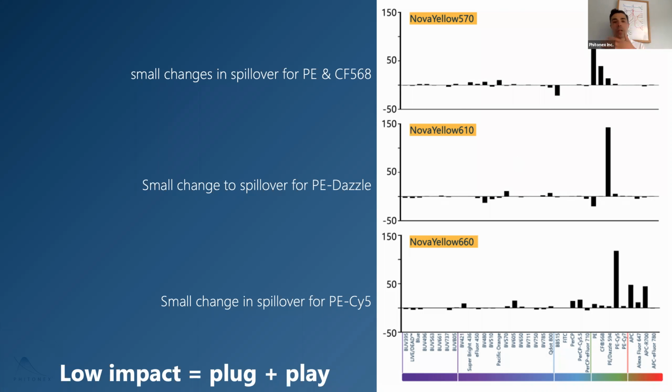And we've actually built out more now in the yellow, after having seen this, and then also moved brighter in the yellow, particularly off like a 700 and a 720, because sometimes you still want to have access to low antigen density markers. And the yellow laser, honestly, in our hands and for all of us, right, has been a good laser for doing that, right? And so this again showed us the way, because there's no spread added anywhere else, right? Even in a completely packed out panel, right?